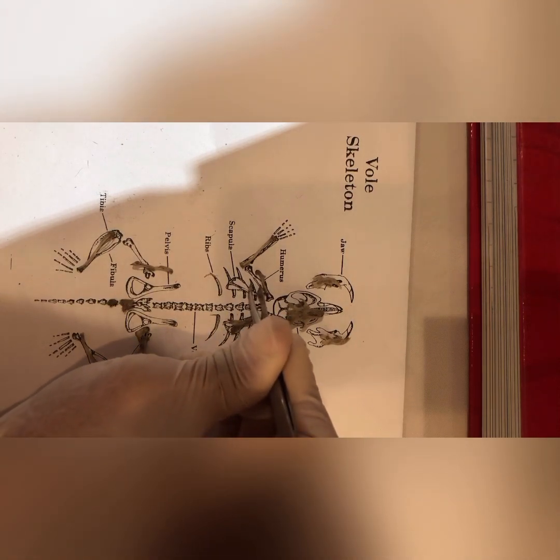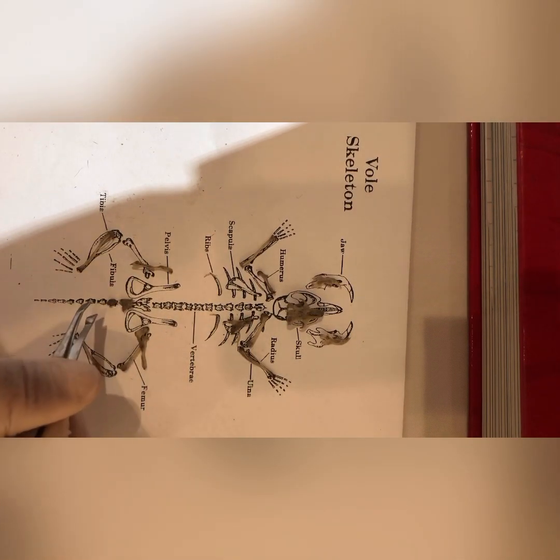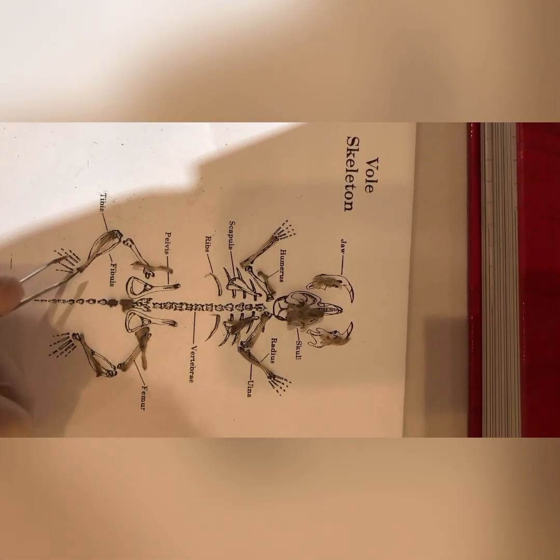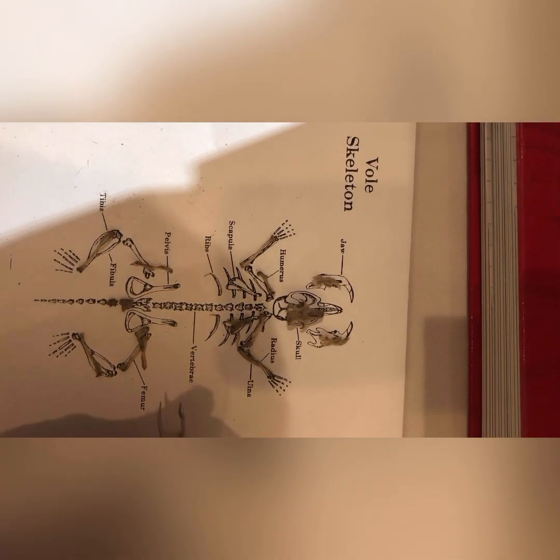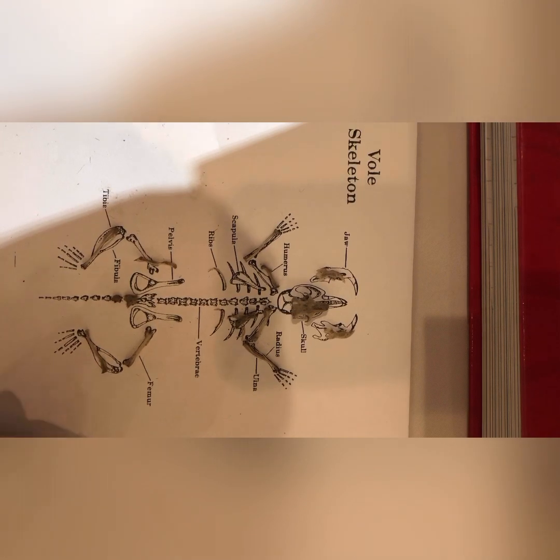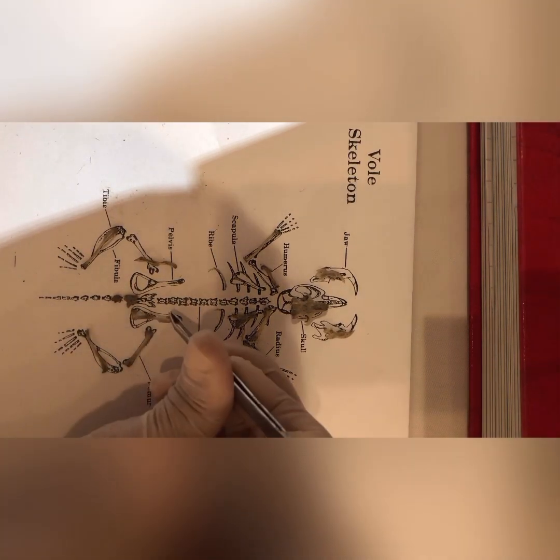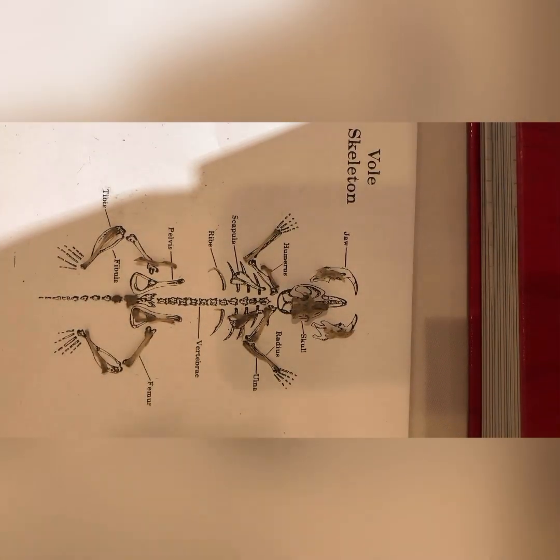We have the humerus. And coming all the way down, we have some of the vertebrae. Some of the other ones are still there. They're just really, really small. And then we have the tibia and the fibula. We have the femur. And we have the two pelvic bones, which are really, really easy to identify.